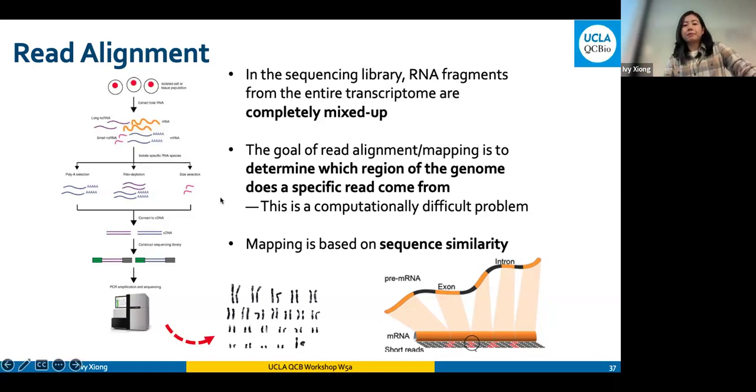Okay. It has to align to every single chromosome of the reference genome. Right. Yeah. So for each read, you have to find somewhere. Right. And it's quite an exhaustive process. That's why it's taking the most time. But with modern computers, it's relatively easy. Imagine the early days of the Human Genome Project, even putting the contigs together takes forever. I don't know how long it took for the whole project, maybe 10 years.